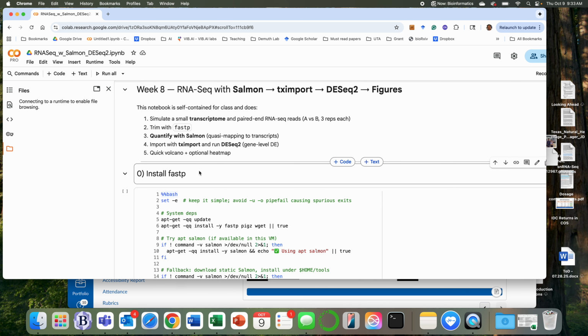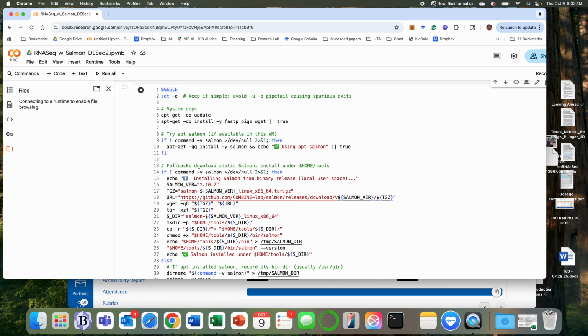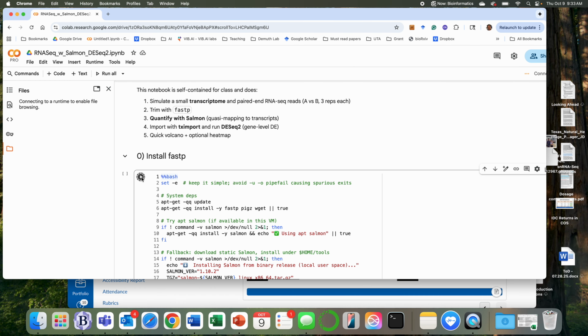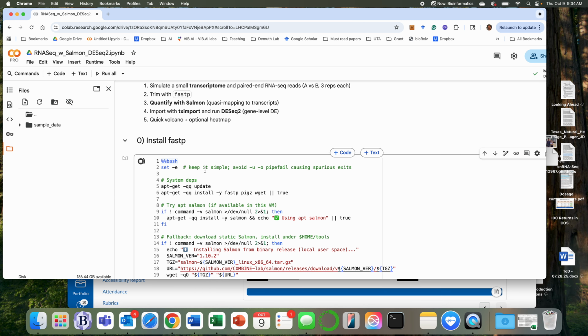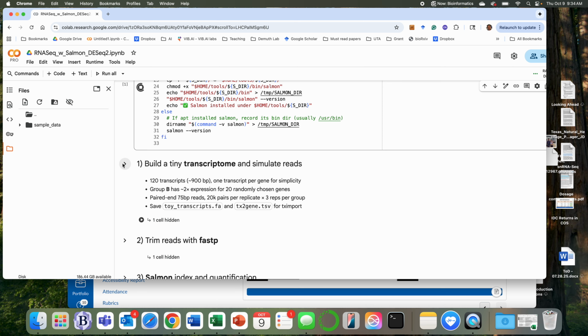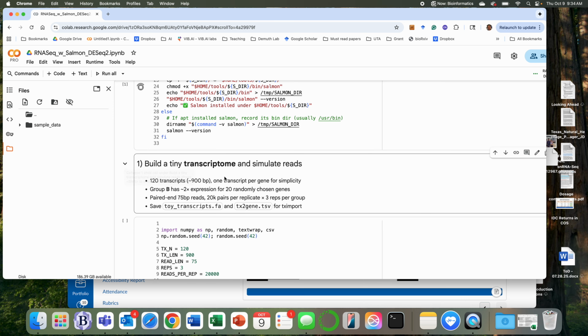The first step should look pretty similar, because QC and error correction is the same for RNA-Seq as it was for genome variant analysis. So this fastp step, installing that software, should go pretty fast, if the bandwidth can support you all.